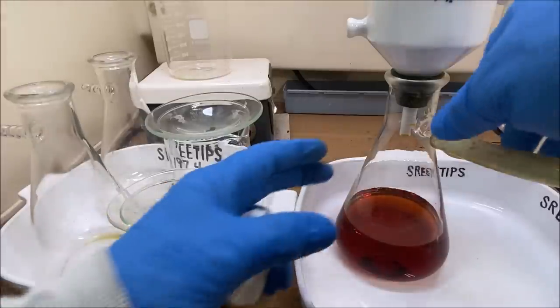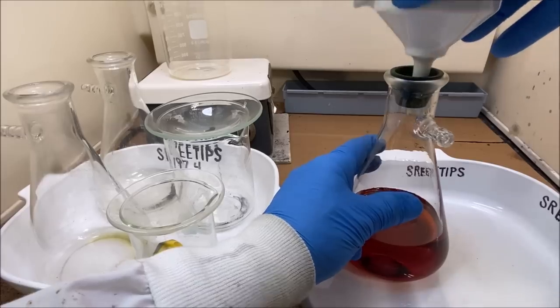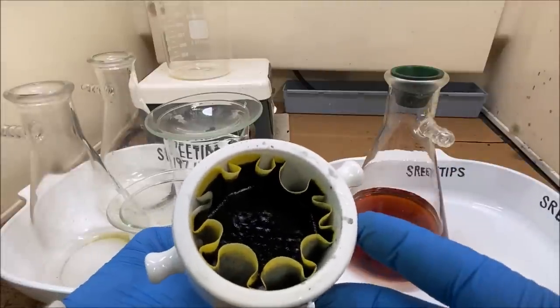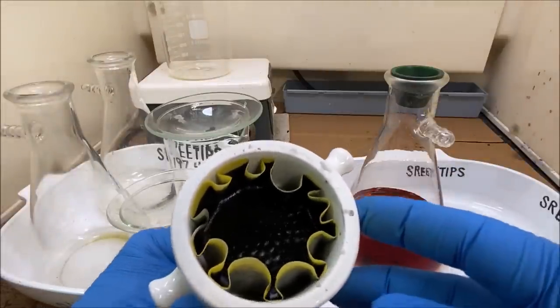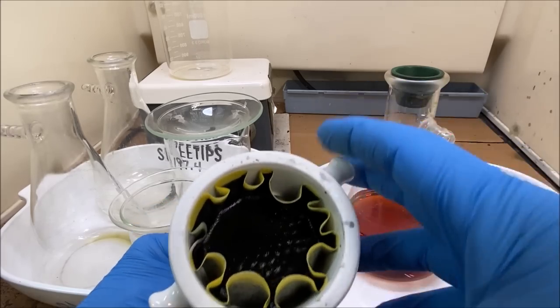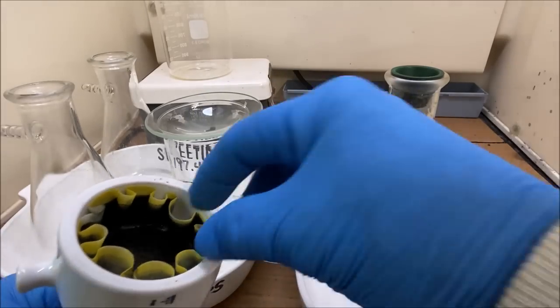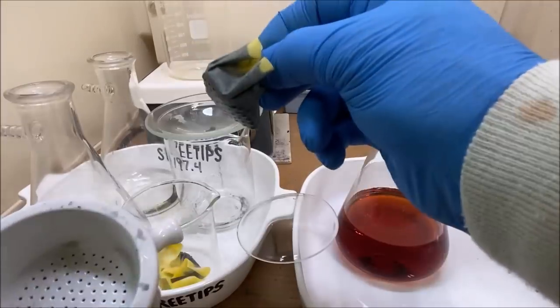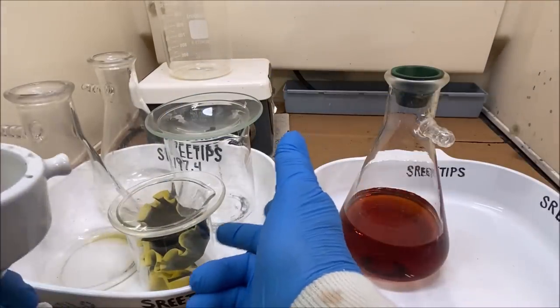I've got all the solids pulled out of the solution now. They are down here in this beaker, or this flask, in this funnel, in this filter paper right here. I'm not quite sure what that is. I could go one of two ways here. I could put this back in a beaker and try to continue to dissolve this.